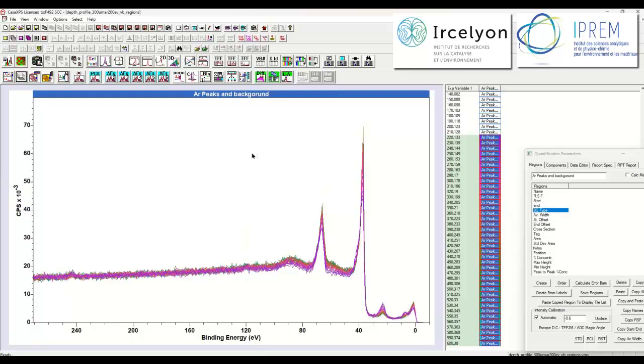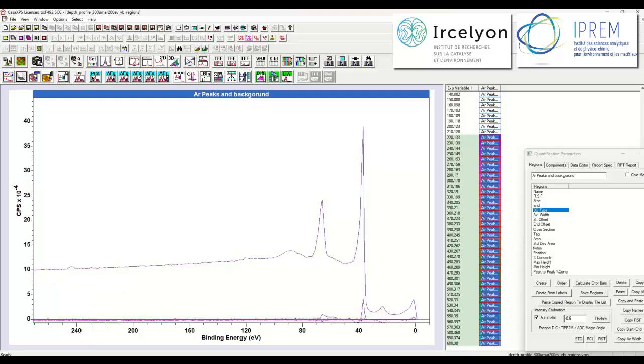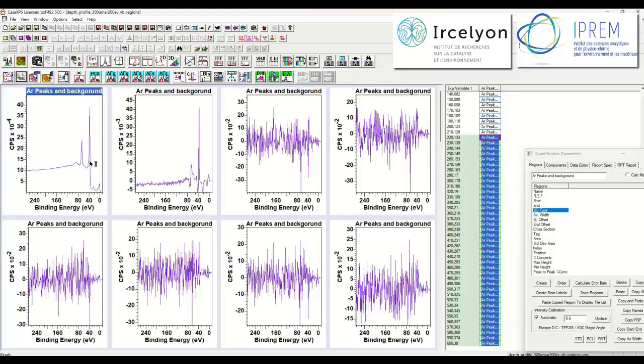And the idea is that we would like to construct a spectrum that does not involve any oxygen. This here is the oxygen 2s. If we remove that from the spectrum, then that will be an approximation to the spectrum that would be pure metallic vanadium. So let's do PCA again, have a look at the abstract factors, and I've made a selection that does suggest we only have 2 abstract factors, so that ought to give us an opportunity of extracting from these data a spectrum that will be representative of metal.